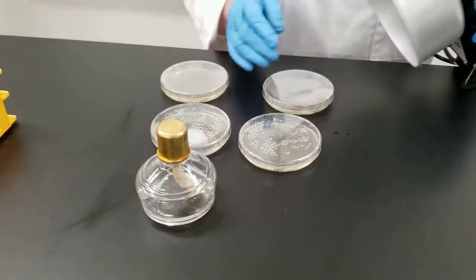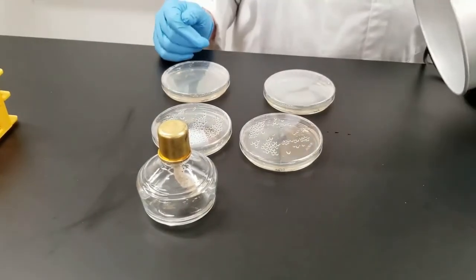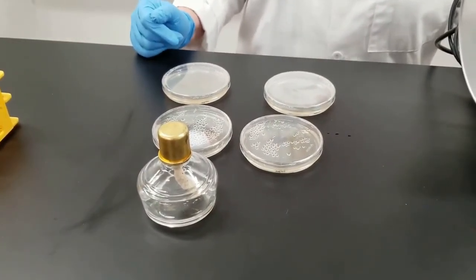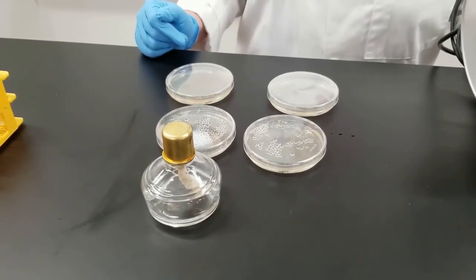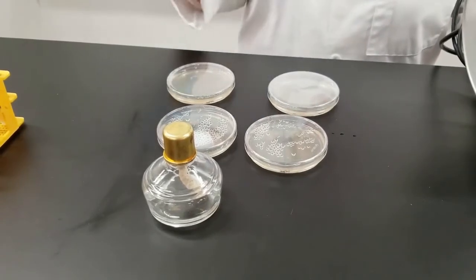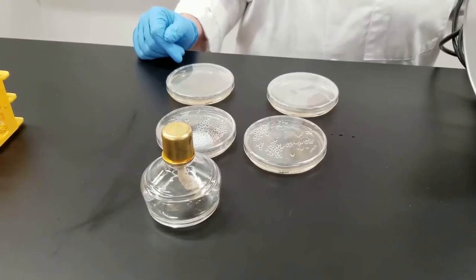There is a UV light in here. We'll take the lid off, we'll place this over, turn on the light for the appropriate amount of time. Just remember, whenever you're doing this, if you do it in person, do not look directly at UV light. You don't want to damage your eyes, so you do need to be careful with that. Once the time limit is up, then we put the lid back on the plate and we will incubate the plate. Everything's 24 hours.